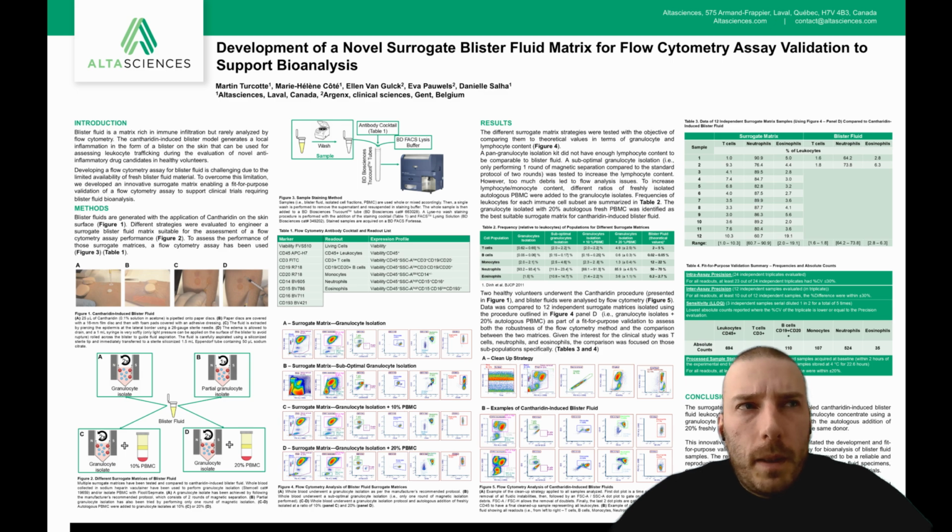To be able to develop and validate a bioanalytical flow cytometry assay with fresh samples, we need to have easy access to a certain quantity of the specific matrix that will be used during the clinical trial. Unfortunately, this is not possible with blister fluid.